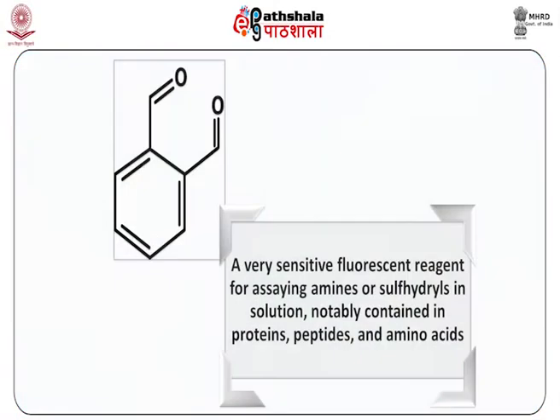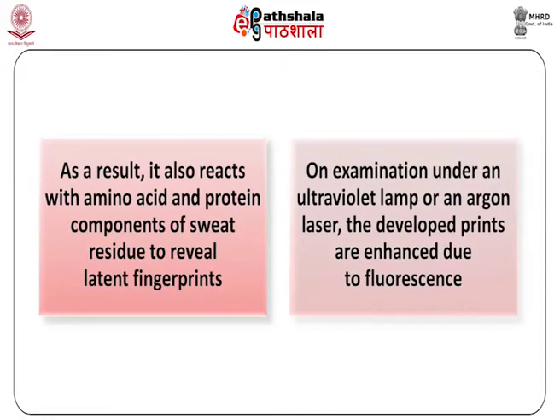o-phthalaldehyde. The o-phthalaldehyde reagent, the structure of which is set out in the figure, is used as a very sensitive fluorescent reagent for assaying amines or sulfhydryl in solution, notably contained in proteins, peptides, and amino acids. As a result, it also reacts with amino acid and protein components of sweat residue to reveal latent fingerprints. On examination under an ultraviolet lamp or an argon laser, the developed prints are enhanced due to fluorescence.